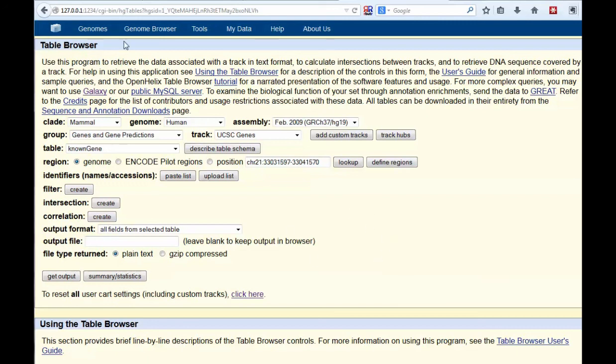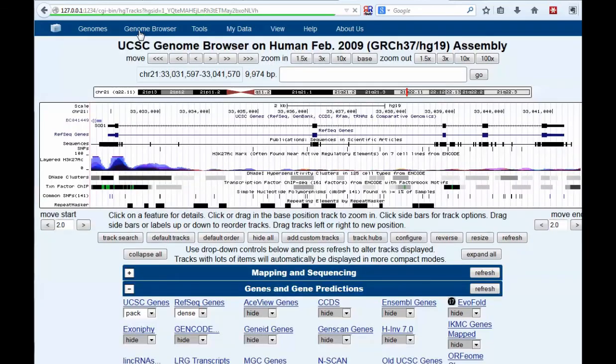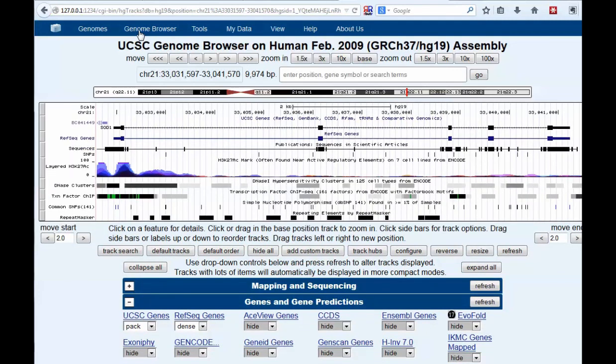There are a few differences, and there are some other things you'll get used to as you use the Genome Browser. The performance may vary depending on your system. There may be other things that you want to tweak. You can mirror some of the tracks — if there are tracks you really need that would be better for the work you're doing, you can mirror those tracks and pull them in, giving you better response time. But you should be able to use the Genome Browser in a Box just like any other browser session, and locally manage and visualize the things you don't want to send across the Internet.